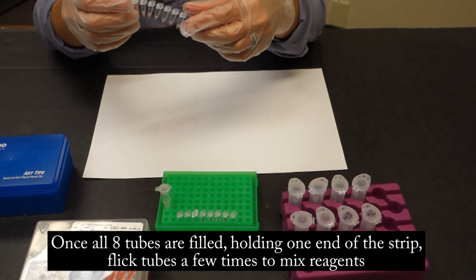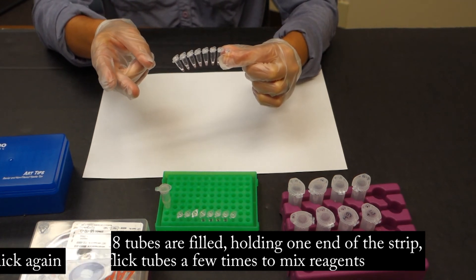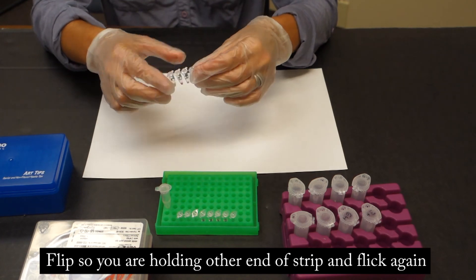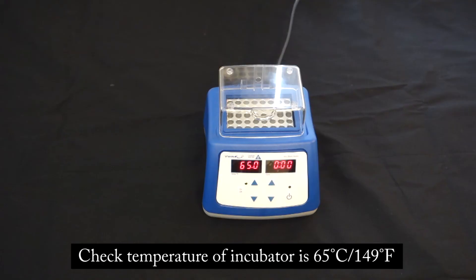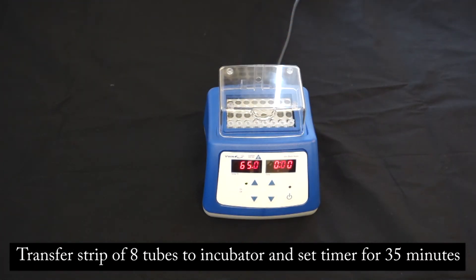Once all 8 PCR tubes are filled, holding one end of the strip, flick the tubes a few times. Then flip so you are holding the other end of the strip and flick the tubes again. Shake the strip of tubes downwards. Take note of the red-pink color of the reagent in each tube. If any of the reagents look orange at this phase, this indicates a problem, as it potentially suggests that the pH has been changed simply by adding plant material. Check that the temperature of the incubator is 65 degrees Celsius, then transfer the strip of 8 tubes to the incubator and set the timer for 35 minutes.